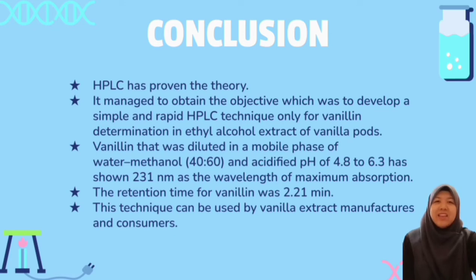In this study, the vanillin diluted in a mobile phase of water-methanol with a ratio of 40 to 60 and an acidic pH of 4.8 to 6.3 showed a value of 231 nanometers as the wavelength of maximum absorption, while the retention time for vanillin was 2.21 minutes. This proved that this technique can be used by vanilla extract manufacturers and consumers.